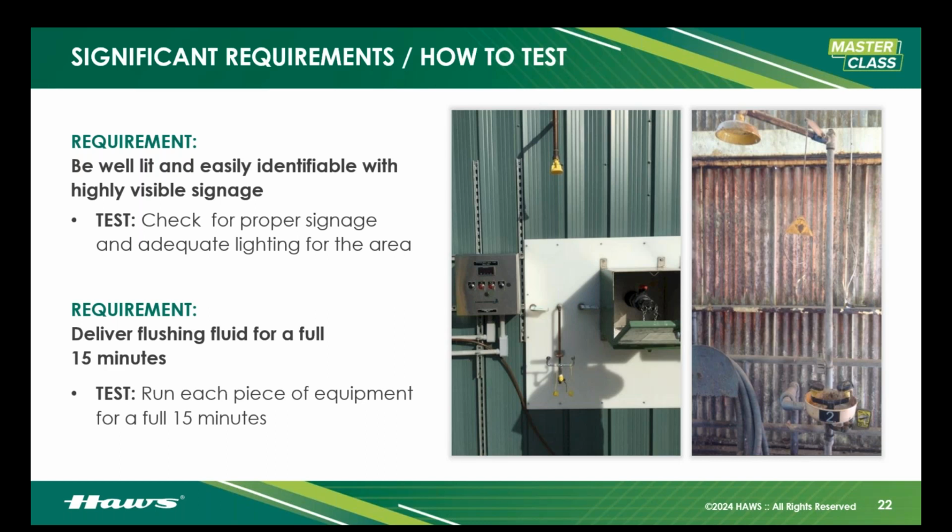This is where the equipment's at, and again, you may not have great use of your eyes, it may be blurry, and so on, and being able to navigate to this equipment quickly is so important. So highly visible signage and well lit. The equipment also has to deliver a full 15 minutes of water. This is standard bare minimum across all safety data sheets, which is where you find that information, okay? It'll tell you 15 minutes, rinse your eyes, 15 minutes, rinse your skin off.